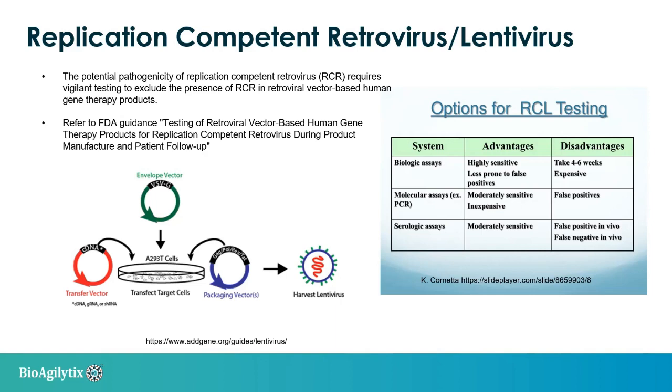It is a cell-based assay, by incubating the cells with the testing material, which includes a 3-week amplification phase and a 1-week indicator phase, with the following detection of virus using either ELISA to test the viral protein, P24, or a molecular assay to test the function of reverse transcriptase. This cell culture-based assay is highly sensitive and has less chance for false positive results.